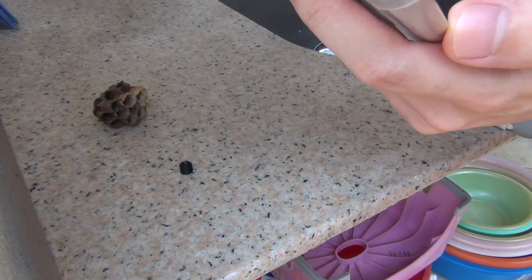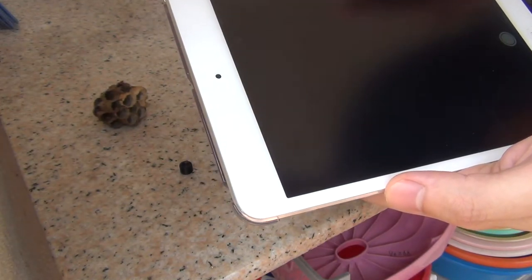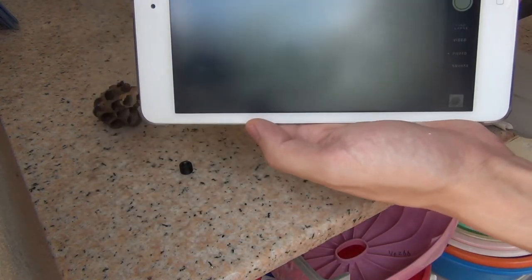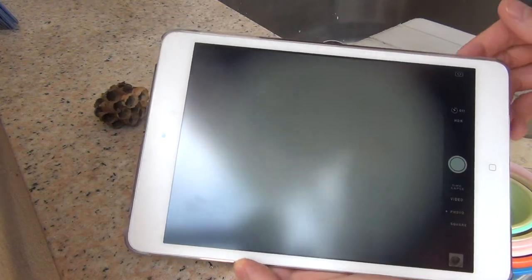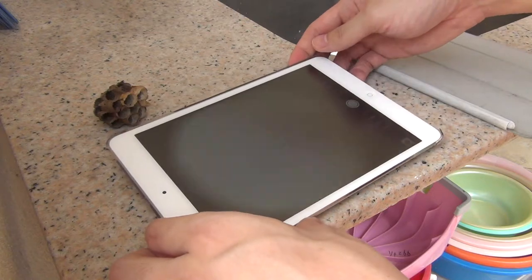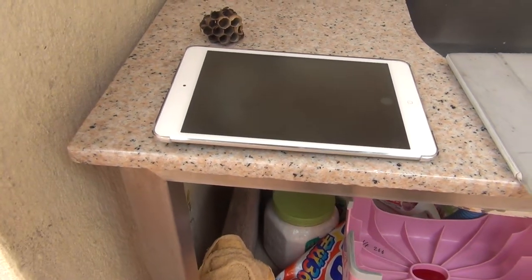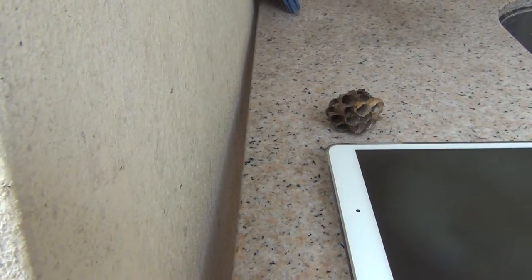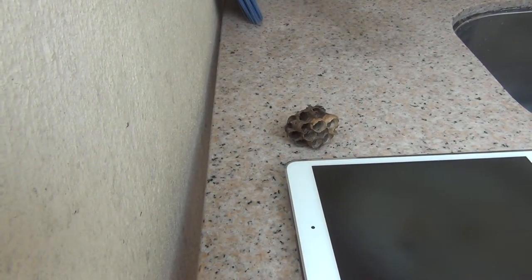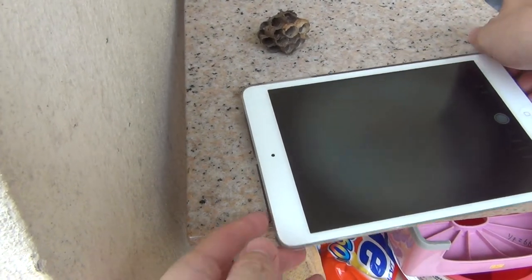Let's see if you can see well enough. There's too much reflection here — that's a lot of reflection. Let me just turn this around. Hopefully less reflection this way.